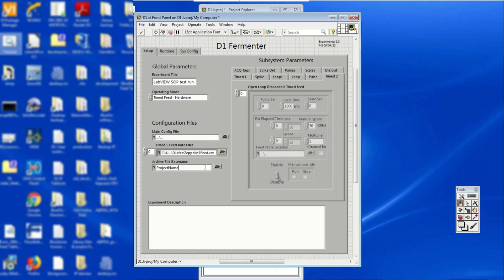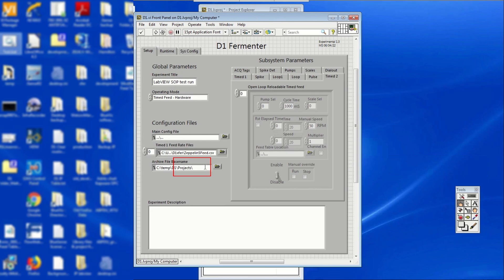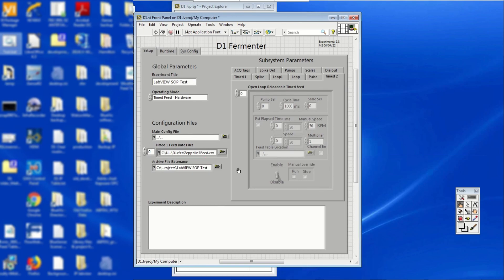Next, in the front panel, under the configuration files, click on the archive file base name bar. The bar should have a project name written. Delete project name and replace it with your own project name. Your data will be saved under this project name.